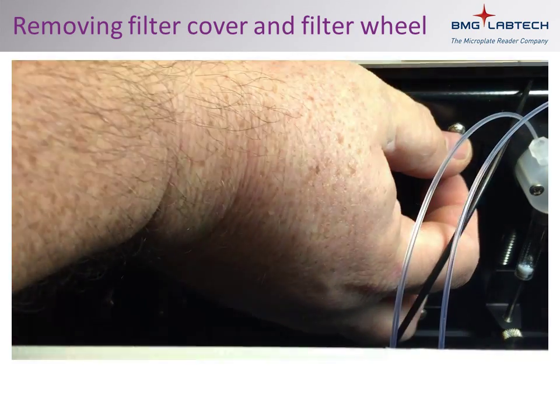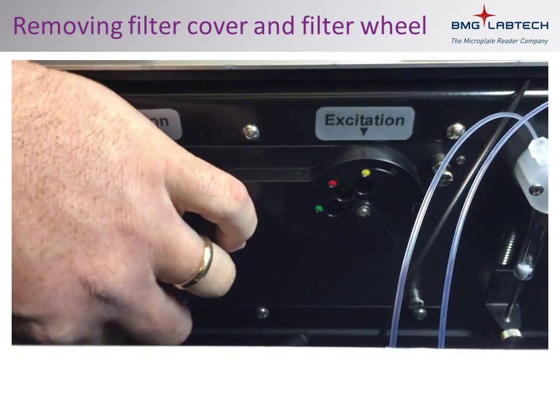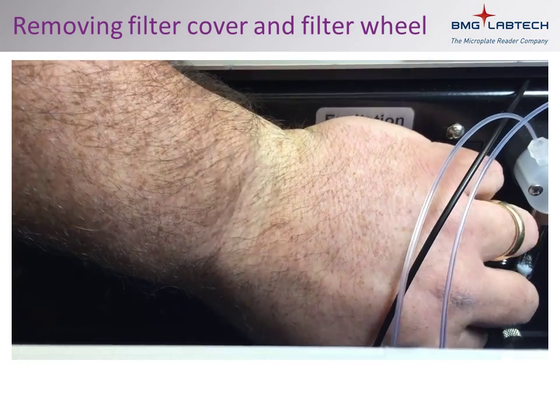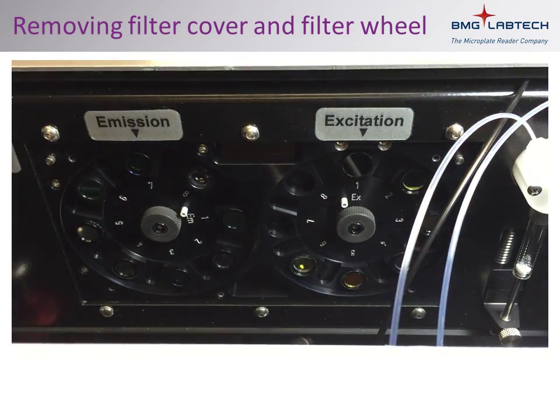With the reader off and the optic cables removed, the first step is to remove the filter wheel cover. Loosen the four thumb screws which retain the filter wheel cover. The cover can then be set aside.